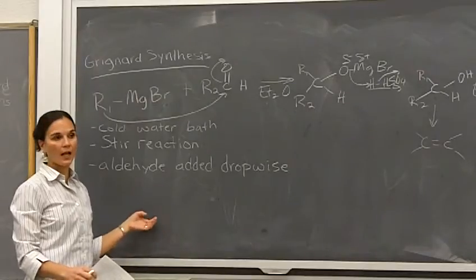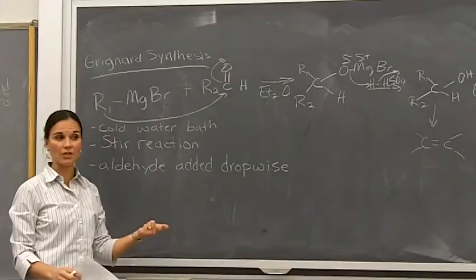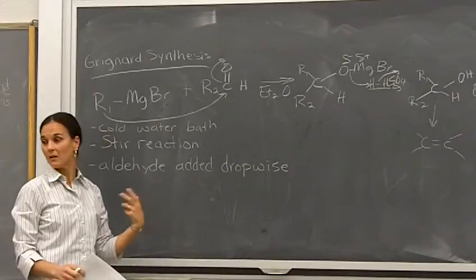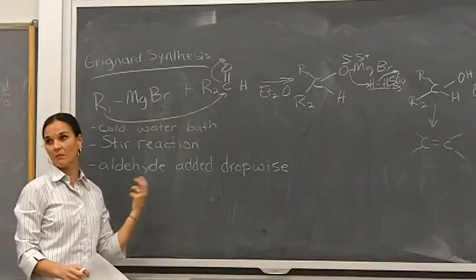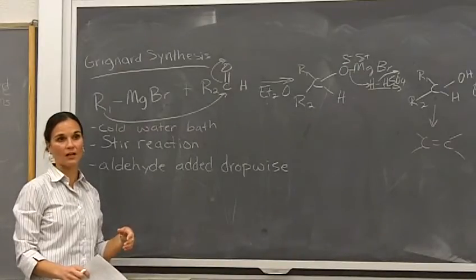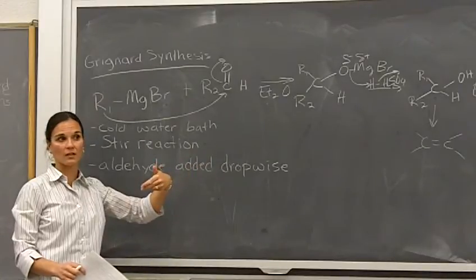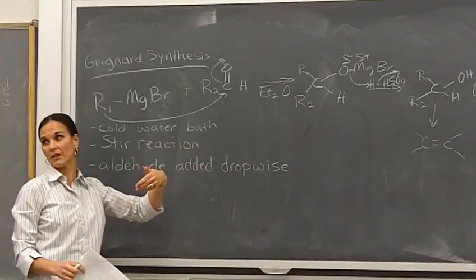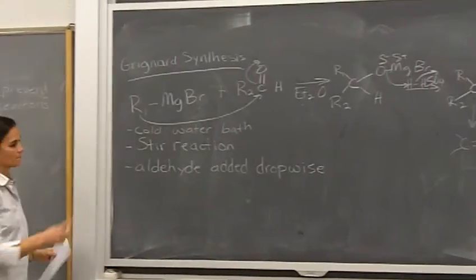All right? And we're going to be analyzing these reactions, experiment 8 and 11, with GC, so we're going to see what's there. Like any impurities, we'll see them, we'll see what's going on there, okay? Including the ketone, and if you make it in 8, you don't get rid of it in 11. You're going to see it in 11 as well, okay? So just be careful with this addition.